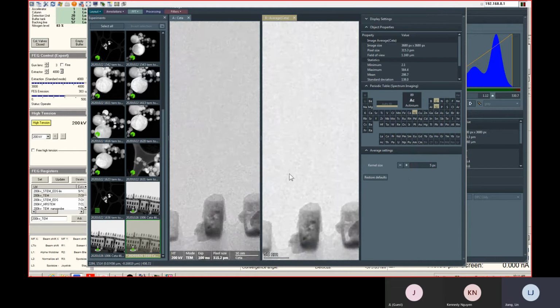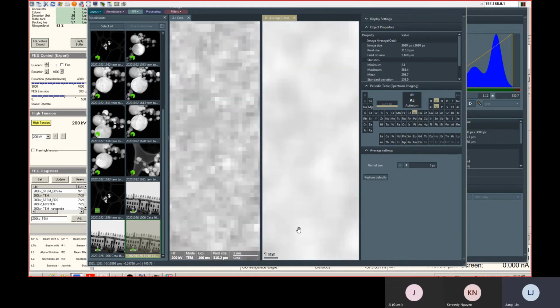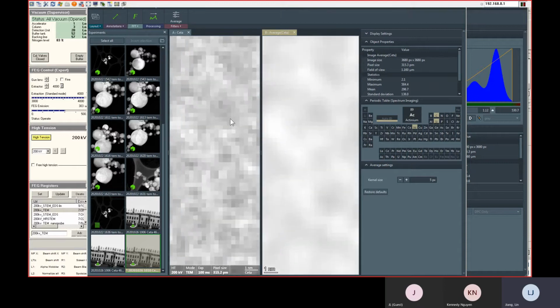It's gonna redistribute your signal. Take a look at each pixel here. This is 1 pixel, 2 pixel. If you do pixel 5, it means 1, 2, 3, 4, 5. This is a 5 by 5 pixel region. It's gonna calculate the intensity and then redistribute this intensity into each pixel.